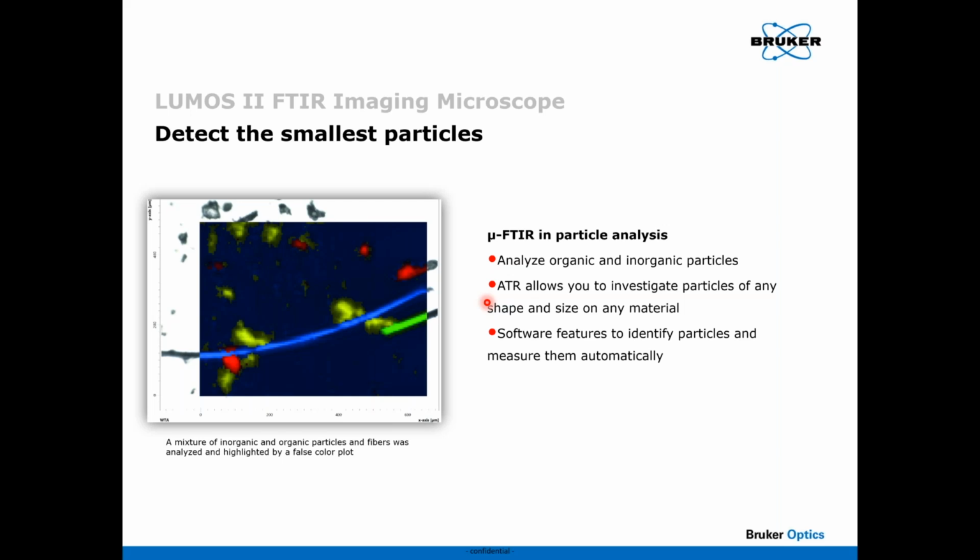If you want an absolute distribution, then you actually need to use a calibration set, which is fine. We have many customers, particularly in the geology community, and some in the polymer community that are looking at distribution to see how well things have been distributed across their product. And so you can do a quantification by anchoring with known concentrations.